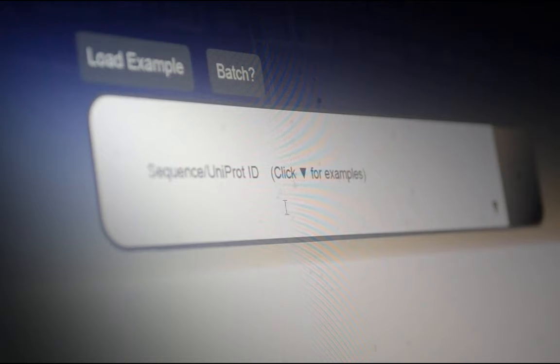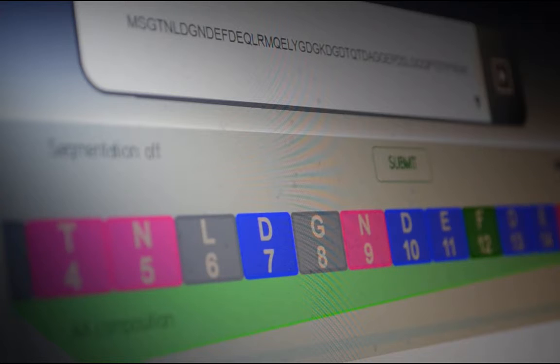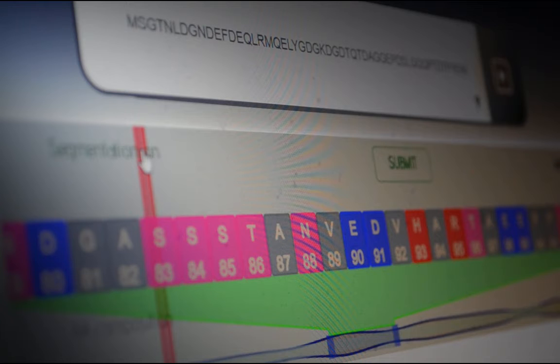Many genome browsers and variant predictors provide an input field to query mutations. Mutaframe takes this a step further by providing an interactive sequence display that allows the users to navigate through the sequence and pick the mutation they want. Already at this initial step, you have access to useful information such as eminent sequence patterns or amino acid counts. Getting mutation information is done through entering UniProt accession names. You can view the retrieved list of available proteins from the drop-down menu and select the one that you want to display the sequence. Using the interactive display, create the mutation you want to retrieve info on and click the Submit button.